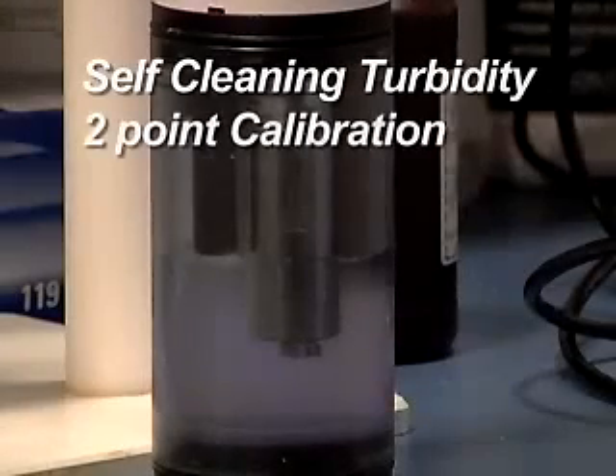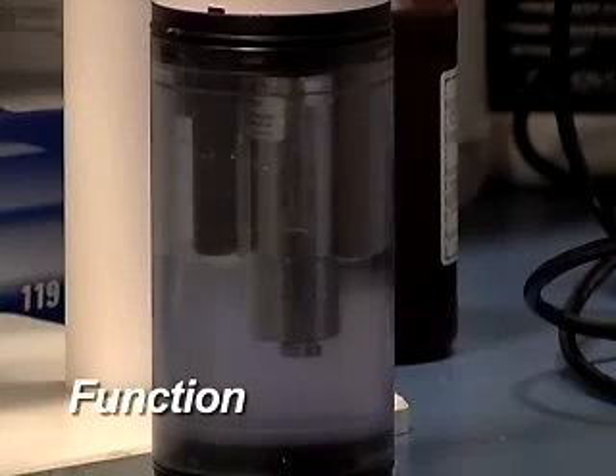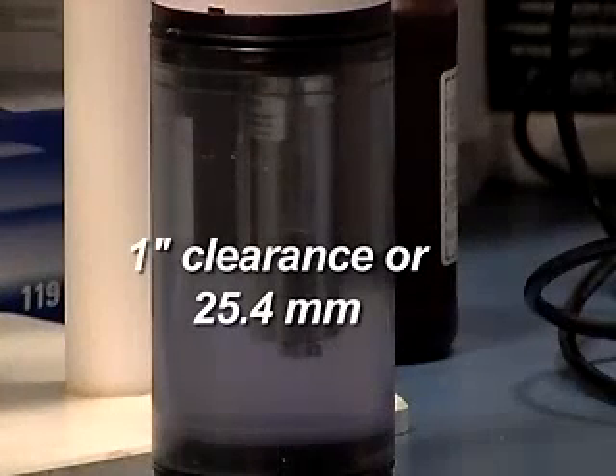Self-Cleaning Turbidity Two-Point Calibration. The Hydrolab Self-Cleaning Turbidity Sensor measures the intensity of light scattered by particles in the water sample at 90 degrees from an infrared light source and reports that value in NTUs. In order to take an accurate measurement of the scattered light, the sensor requires an unobstructed view of the water extending approximately one inch or 25.4 millimeters from the end of the sensor.